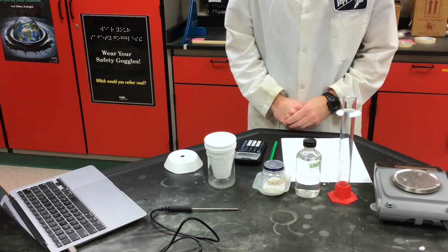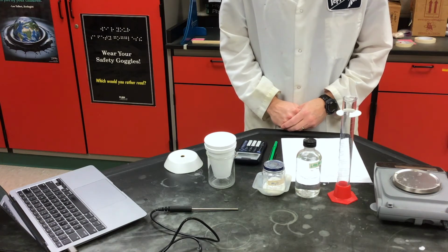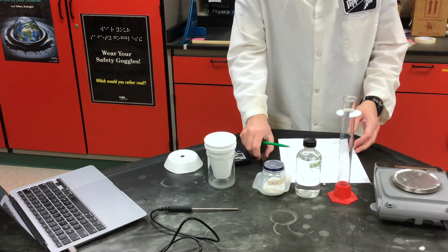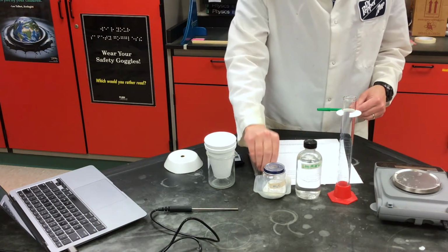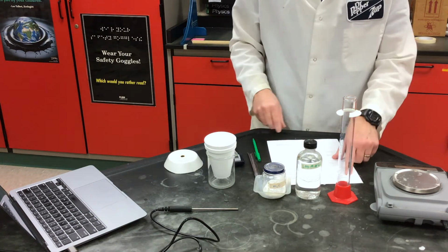College chemistry. Today we're going to talk about Hess's Law Lab, Lab 6.3. What I'm going to do is work through part 2 of the lab with you. Your job is to follow along with part 2, and then you're going to be able to do part 1 in the lab. Or if you are virtual, you will be able to get some makeup data and work through the calculations. So I'm just looking at the procedure.